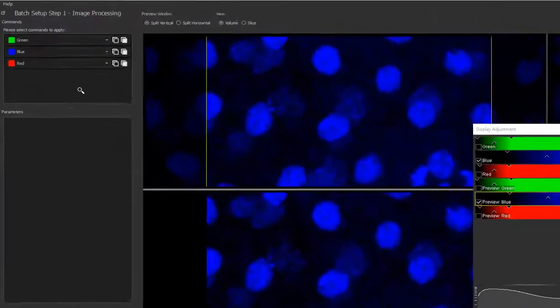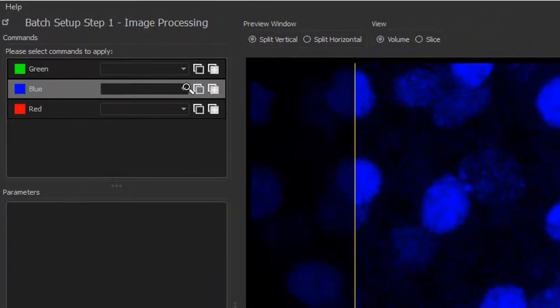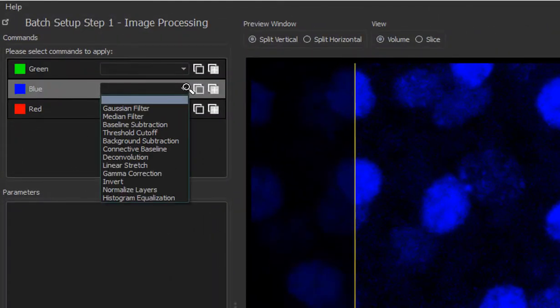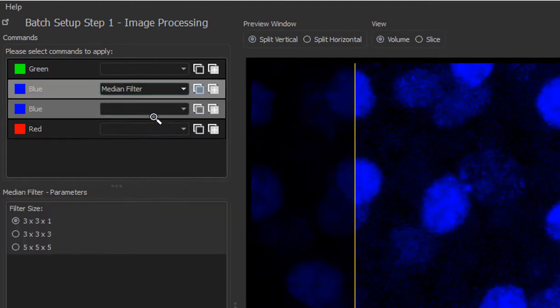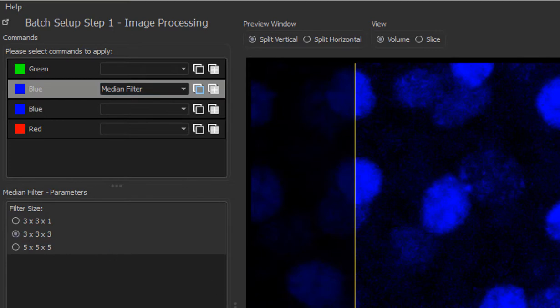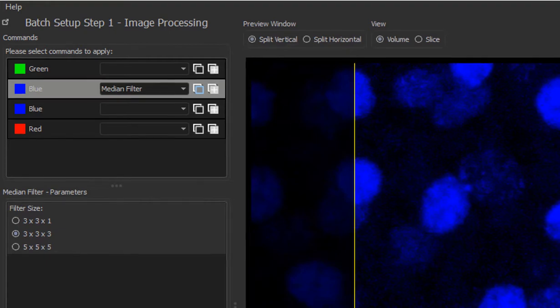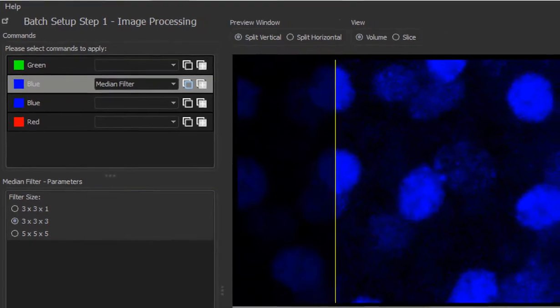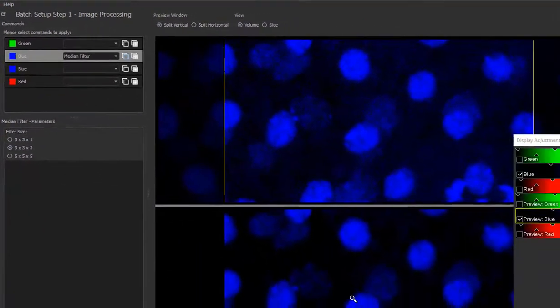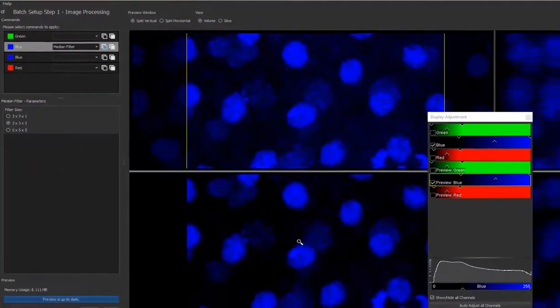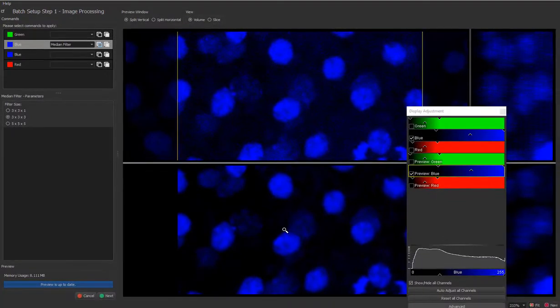In the Batch Setup Step 1, image processing, select median filter from the drop down menu for blue channel and then select 3x3 sampling window. As shown in the image processing tutorials, you can add multiple image processing operations to different channels in this step, but here for simplification, I will focus on one channel.